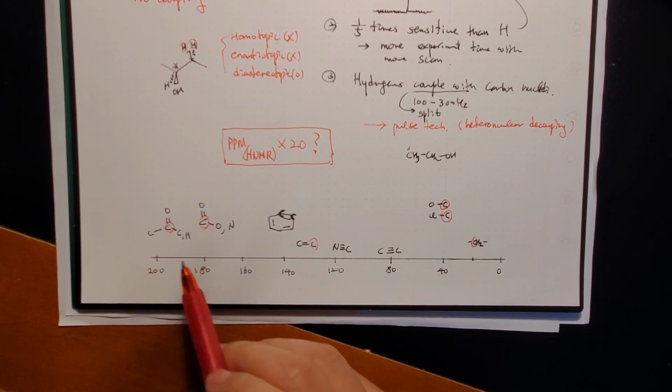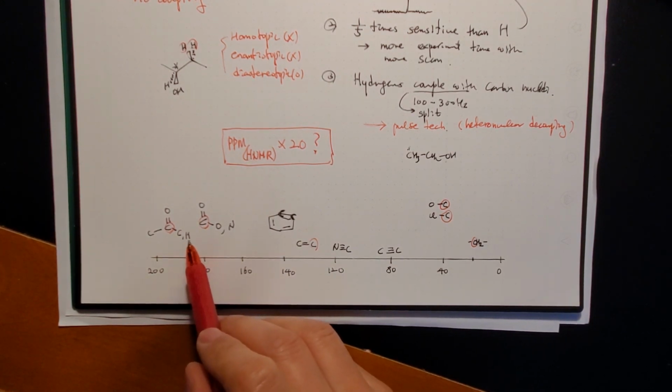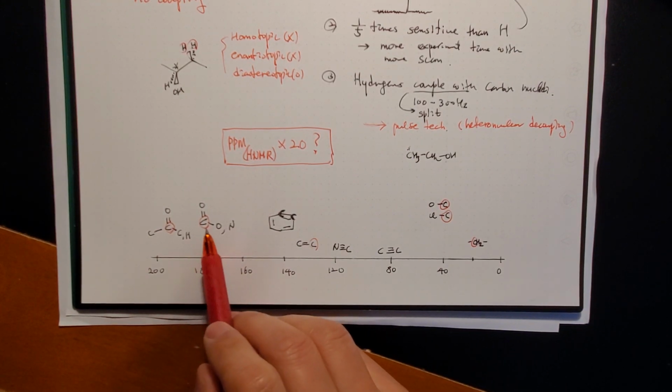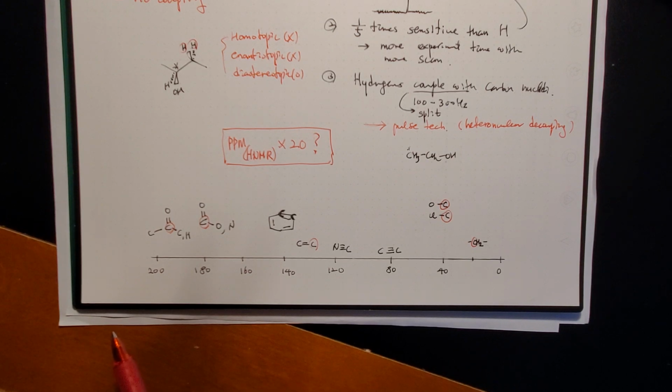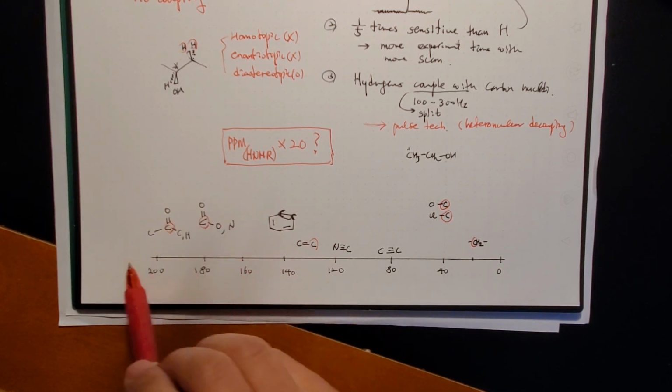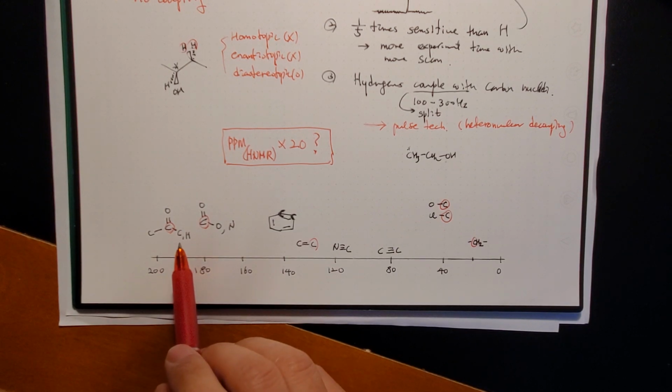And if you have carbon and hydrogen, ketone and aldehyde, they are more likely to have a greater number than 180. And those esters and amides are likely to have a smaller number than 180. But again, I'm not going to go strictly by that if you're a non-major. So carbonyl carbon around here is enough, okay?